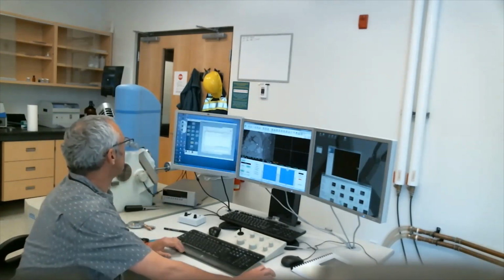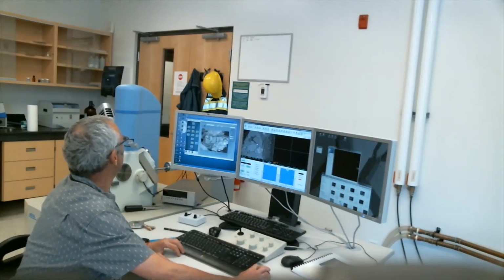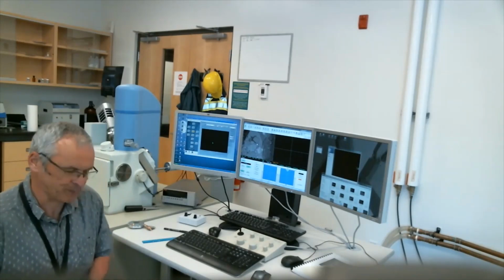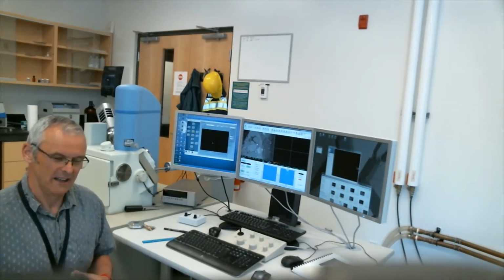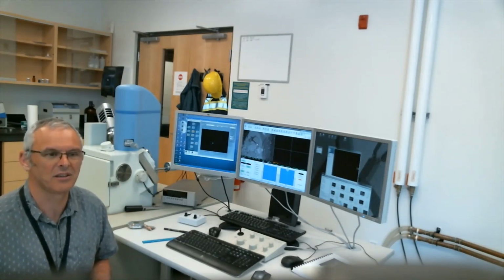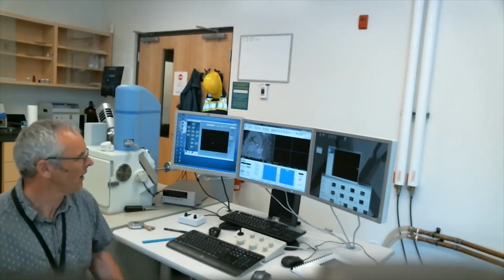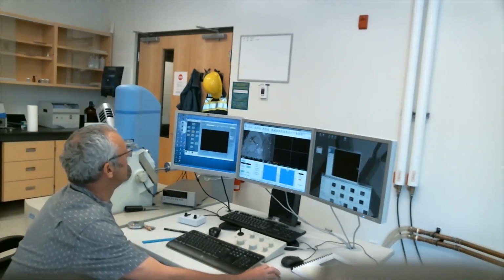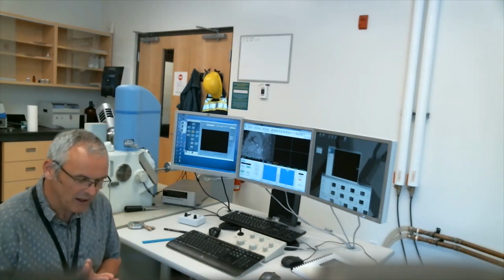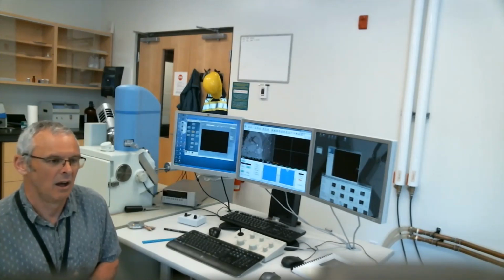When I'm working with EDS data, this is what I consider to be our worst case scenario. When we have a rough sample, it's not carbon coated, it's not flat, okay? This is the worst case scenario. Especially for imaging, it's great, gives you really nice, pretty pictures. You can see the very bright features there. But in terms of analysis, this is a very problematic situation.